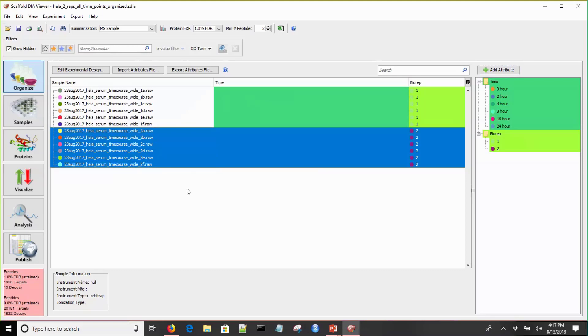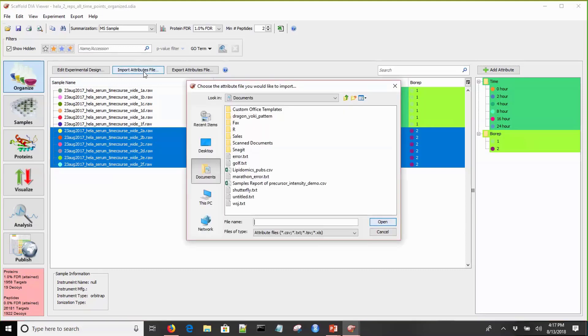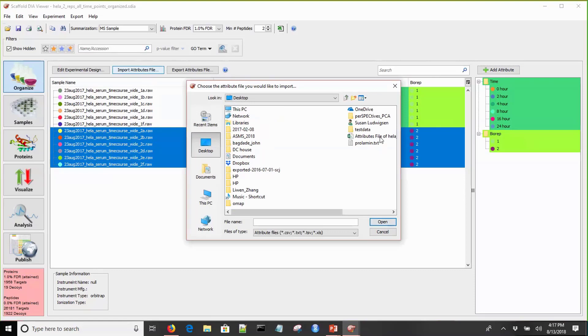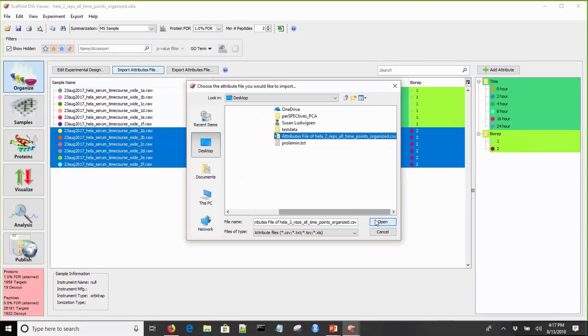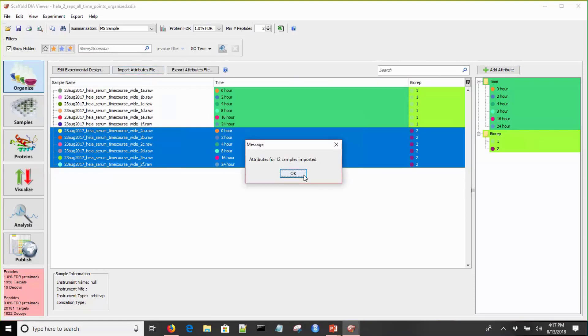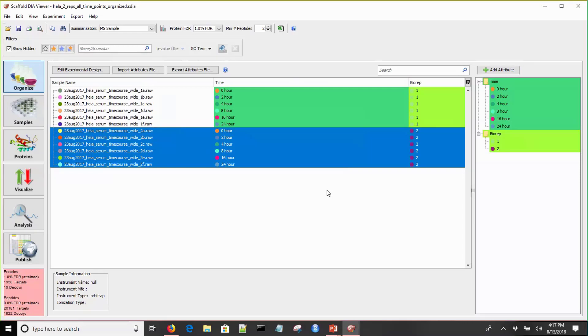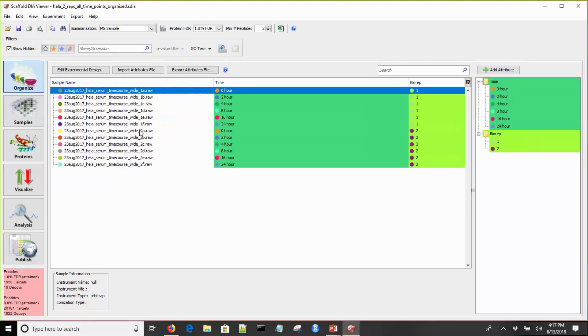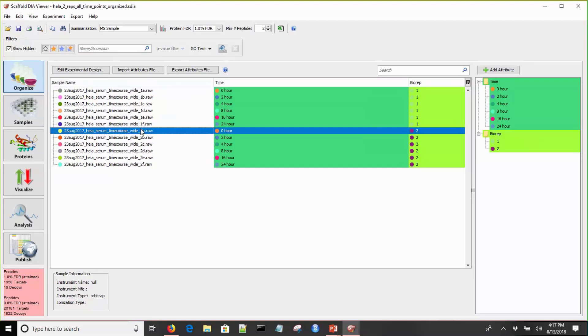The easiest way I think to do this is to highlight a group of samples that you want to define. I'll grab all of the replicate 1 samples, highlight them, right click, navigate over, and define these as 1. We'll highlight our other set of samples, right click, and define these as biological replicate 2. Now we have all of our biological replicates defined. For convenience, we have the ability to import an attributes file either from an existing Scaffold DIA experiment or created in Excel.